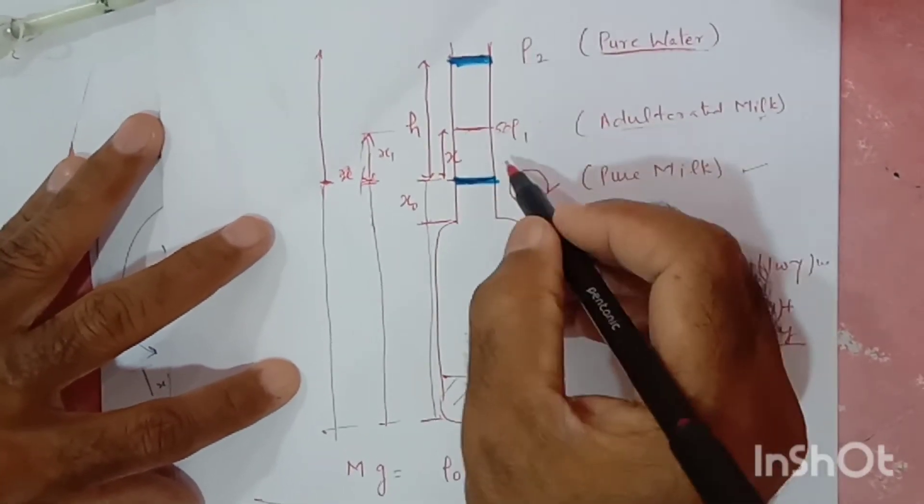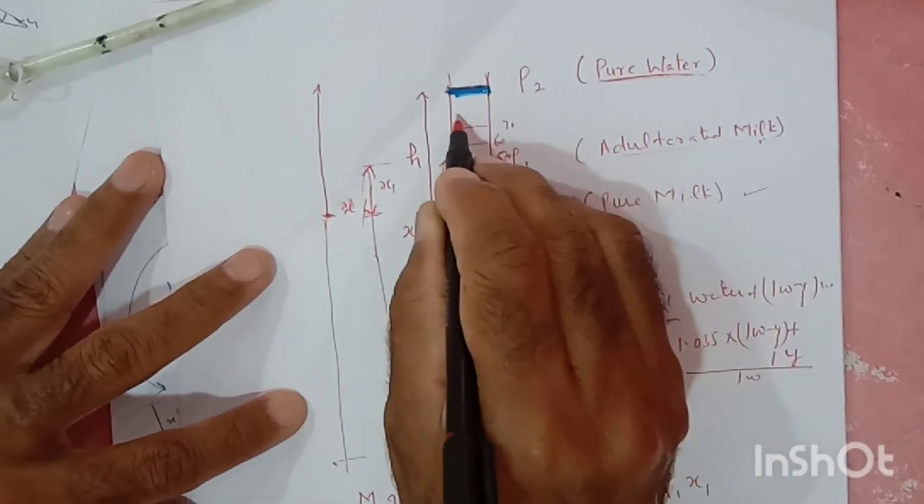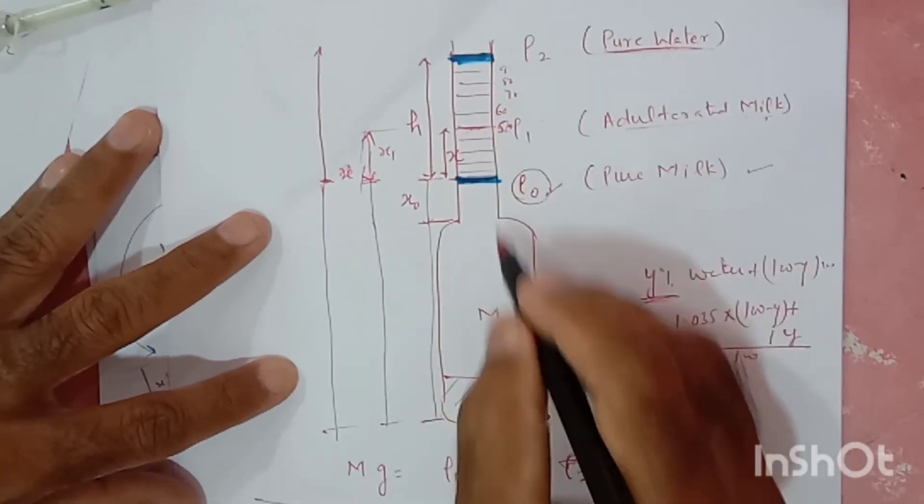In this way I can calibrate my scale. This mark is 50% adulteration, this one 60%, 70%, 80%, 90%, 100%. Like this we can calibrate and design markings on the lactometer.